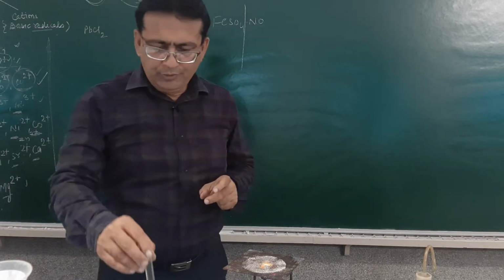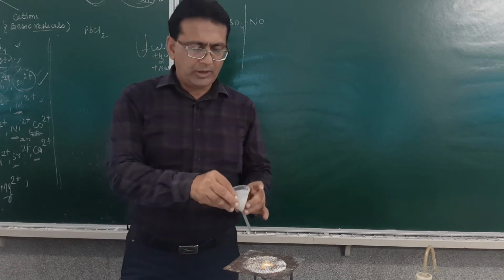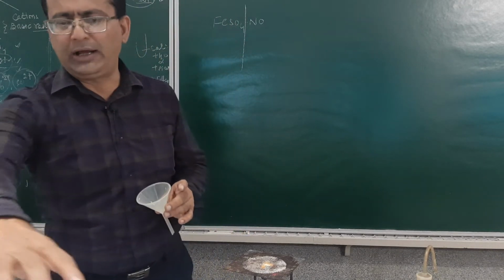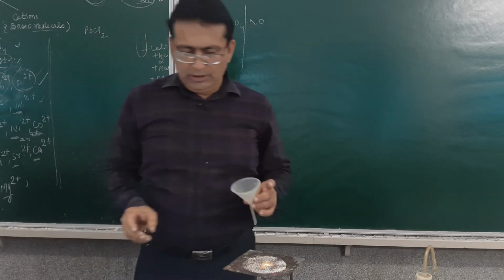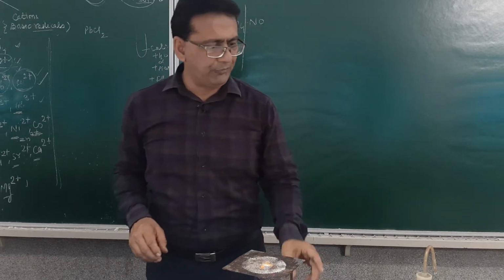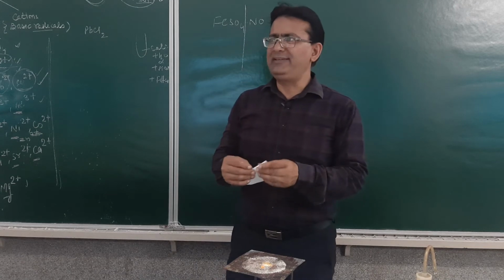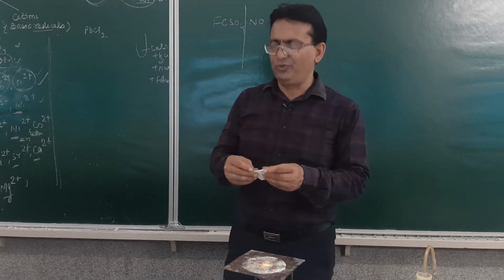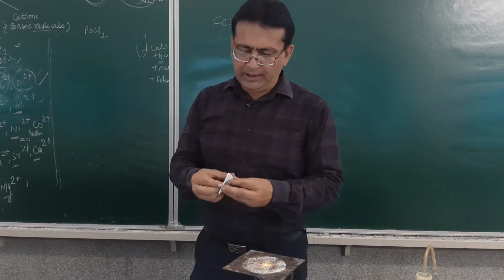I will filter this solution. So filtration will be done again in the similar manner that we discussed earlier. I'll take a filter paper, make a first fold of this, and after making the first fold, I'll make a second fold. Am I clear?